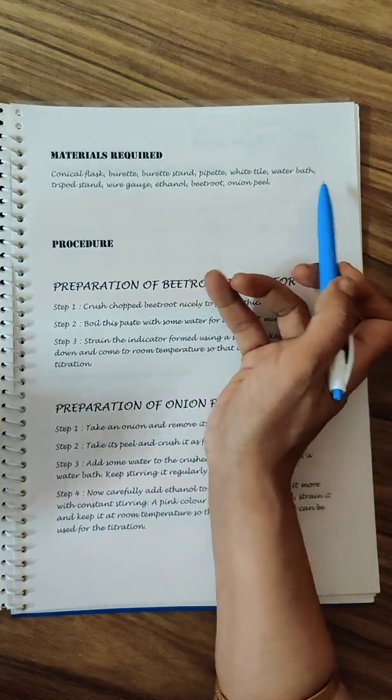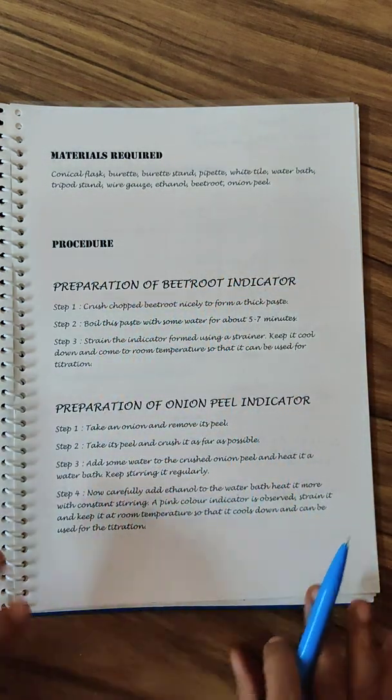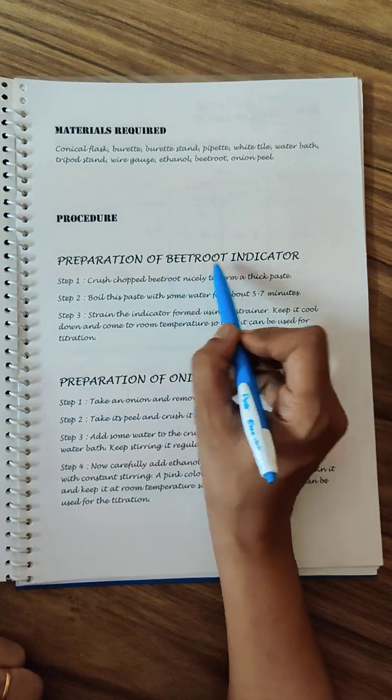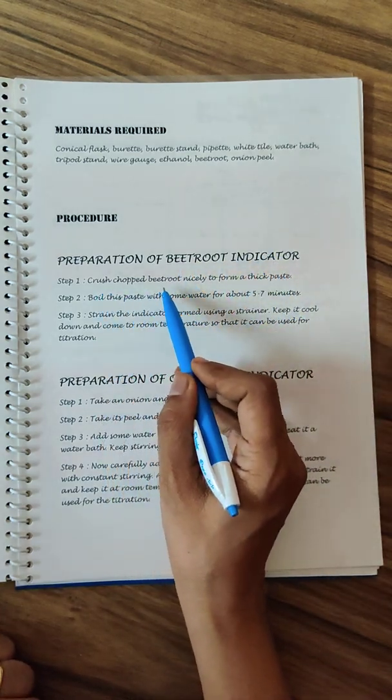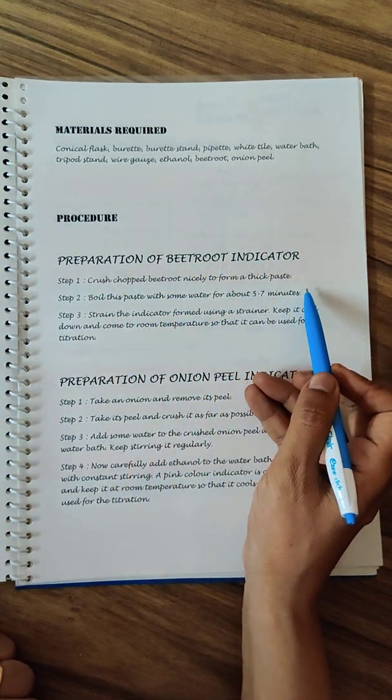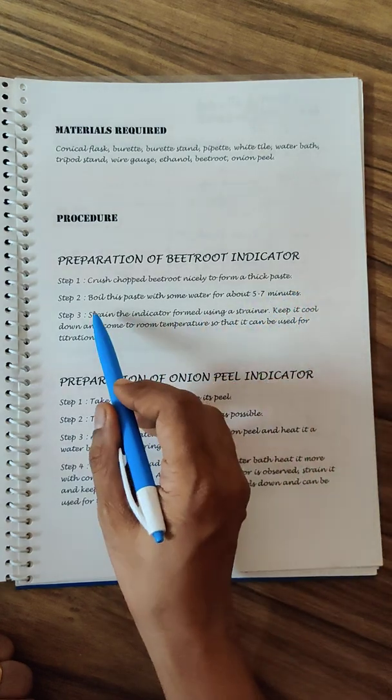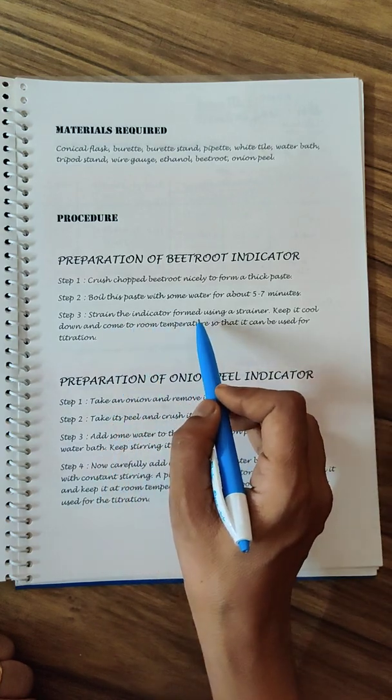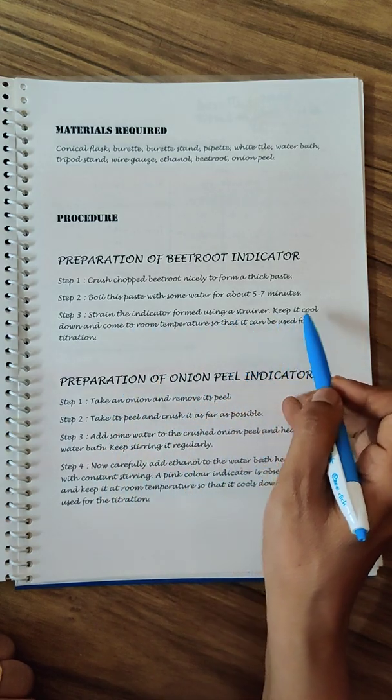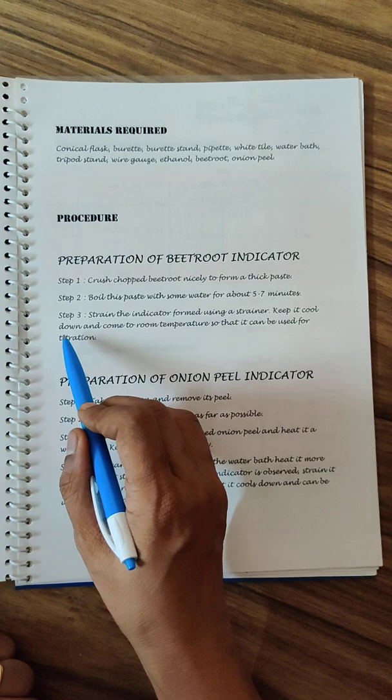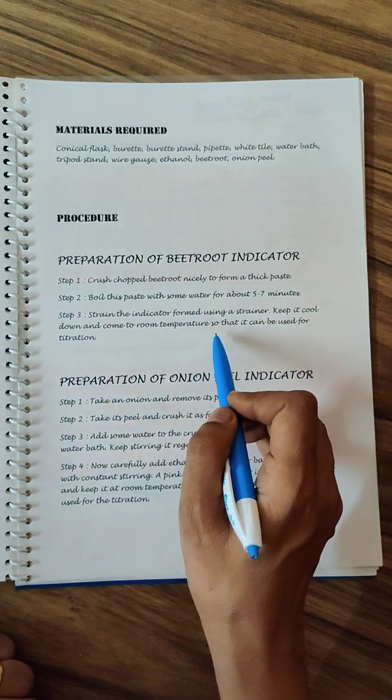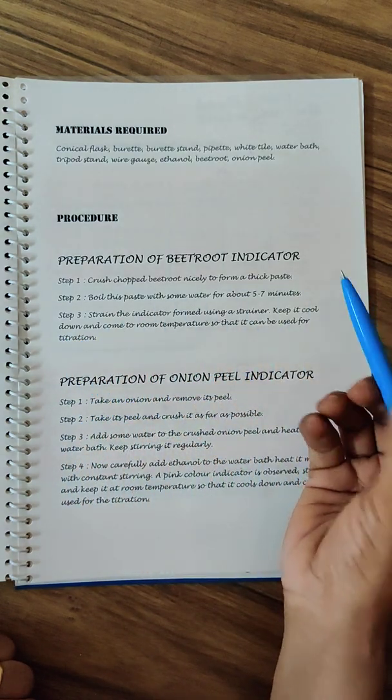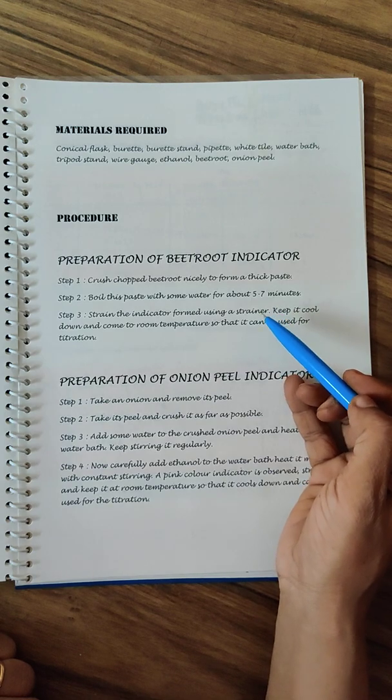The procedure - you need to prepare the two indicators. For the beetroot indicator, you need to chop the beetroot nicely in the form of a thick paste. You can use your mixie also. Boil this paste with some water for about five to seven minutes, then you need to strain it using a tea strainer at home. Keep it to cool down to room temperature so it can be used for titration. It's nothing but a filtered juice of beetroot.